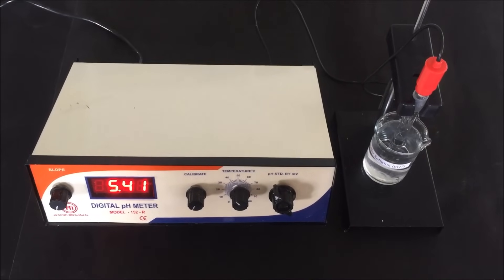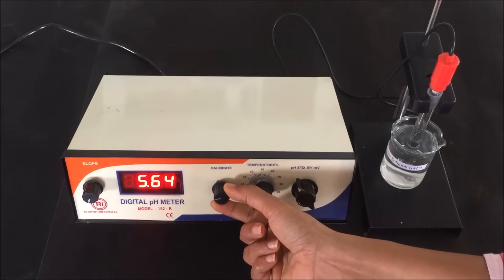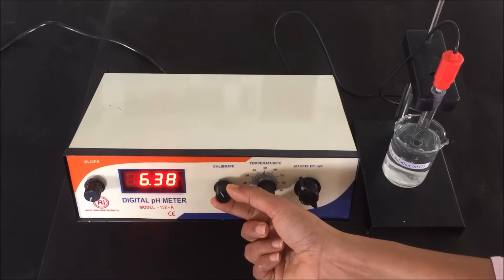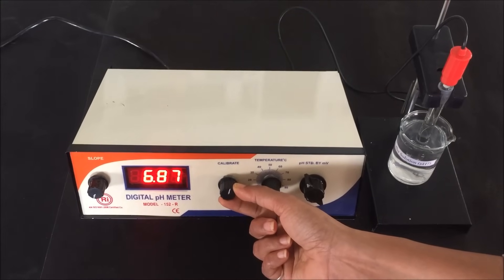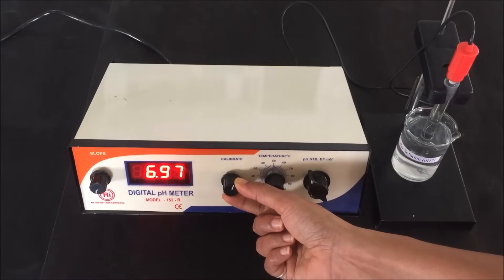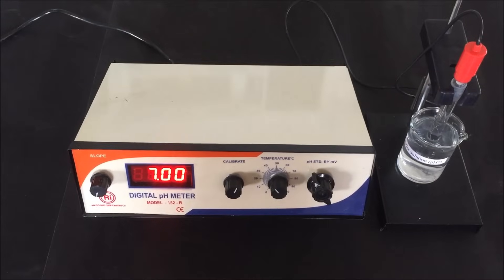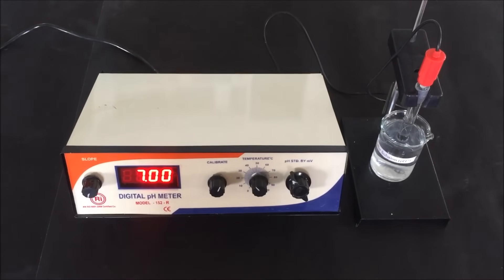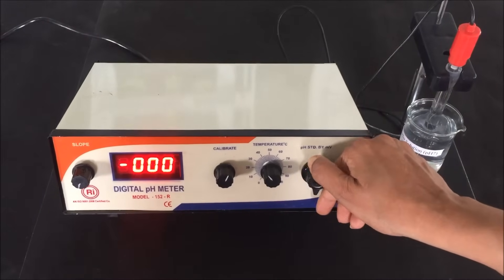Now we have to set the pH to 7, which is the pH of our buffer solution. Rotate and adjust the calibration knob until the display shows pH 7. Always start calibration with the pH 7 standard buffer solution and then with the pH 4 buffer solution, because at pH 7 the electrode is at zero point, and therefore zero-point calibration must always be performed first. The meter display reading is now set to pH 7.